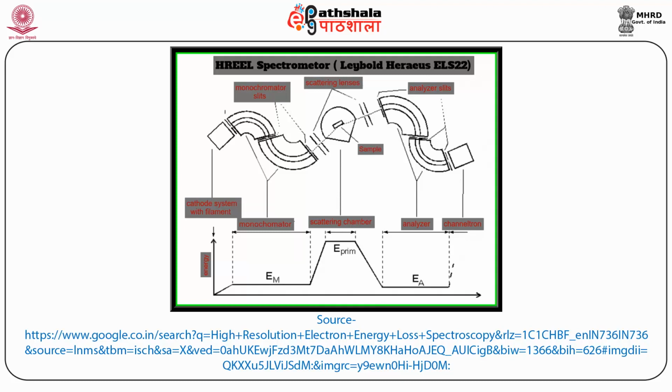And the deflector electrodes have a saw-tooth profile to backscatter electrons which are reflected from the walls, in order to reduce the background of electrons with a wrong ejected energy. The electrons are then focused by a lens system onto the sample.